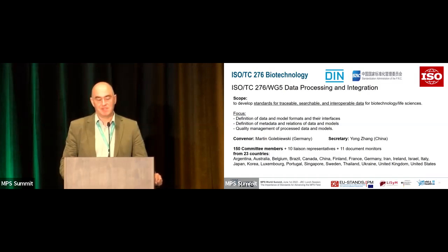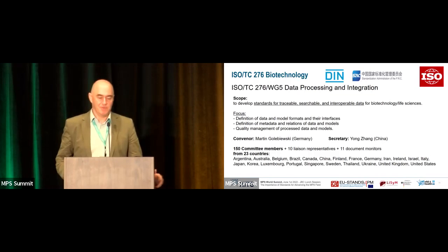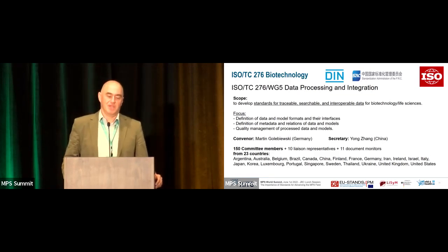This is quite a parallel effort that fits really well with the FAIR guiding principles that I introduced to you before. The focus here is the definition of data and model formats and their interfaces, but also the definition of metadata and the relations of data and models, and also quality management of processed data and models.